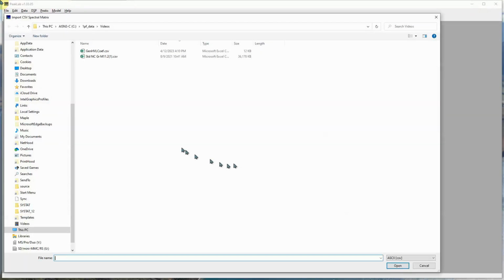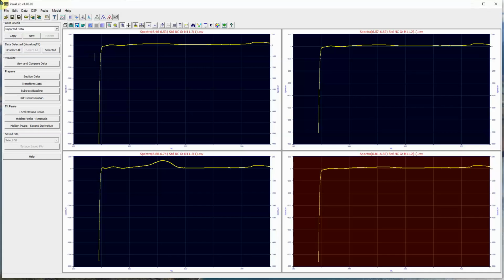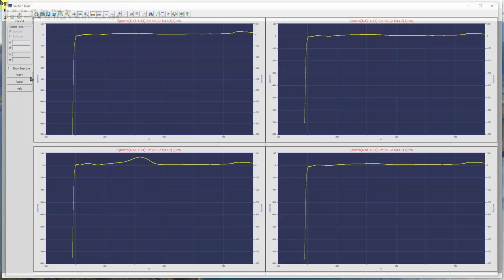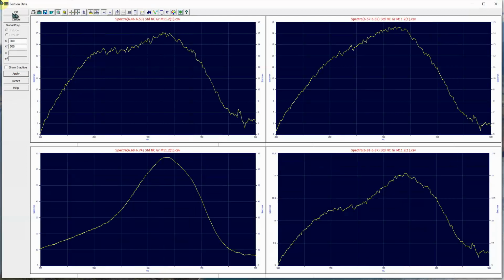So I am now going to be loading these four spectra. The first thing we're going to do is section the UV-vis spectra to be in the range of the absorbances we wish to look at. In the peak that was so prominent, you can see it's not very noisy. The three tiny ones, you can see it's clearly there is a measure of noise there.